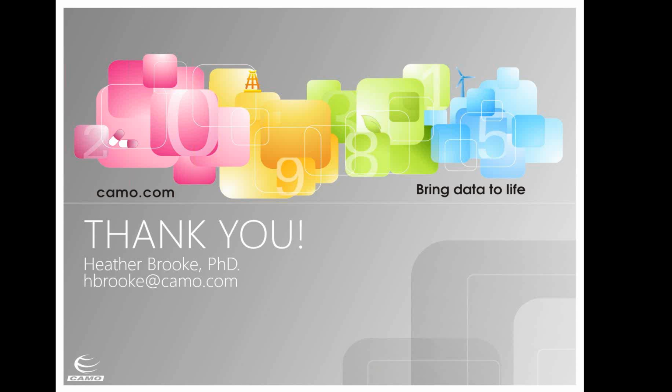It could be that you have a lot of variation, if your prediction range runs from 0 or very low values to a very high value. It could be that there's just a lot of variability in those lower ranges, and in those lower numbers, it actually crosses 0. So there's a lot of things that could be happening there.